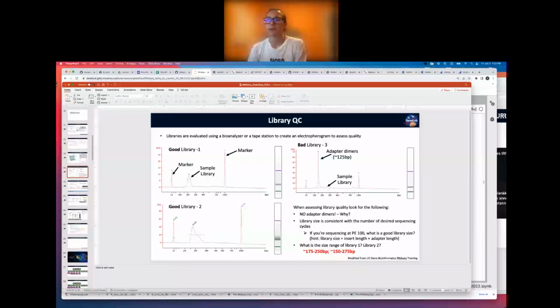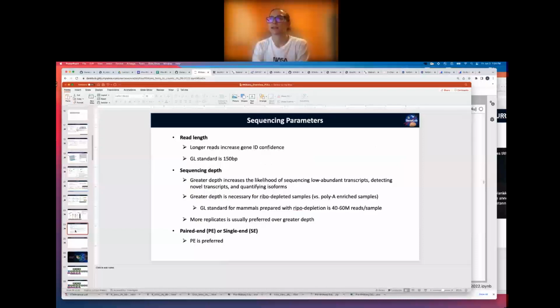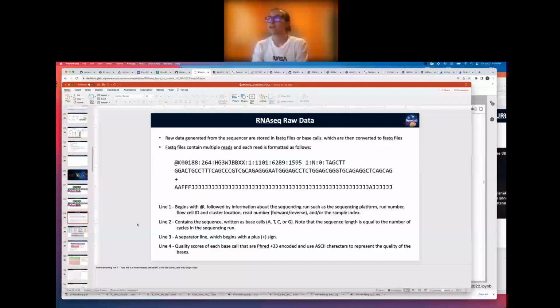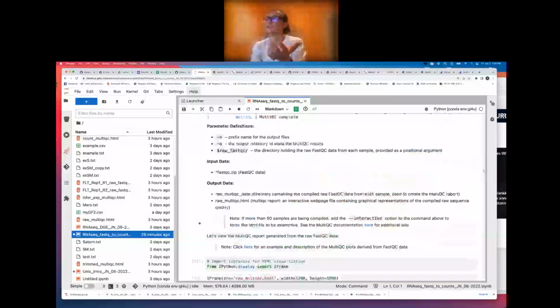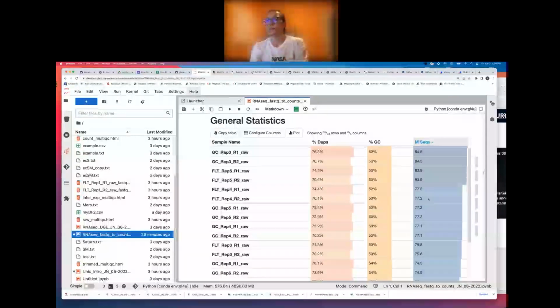And there are labs too. That's why, if you don't know much about your data and you outsource it, not all core facilities are going to do that initial test run. So when you do your raw data FastQC analysis, that's something you want to check to see if they are indeed balanced. The other thing you can do in silico, if you outsource your sequencing data, get your raw data back, and notice a really big difference in the number of reads for the samples.